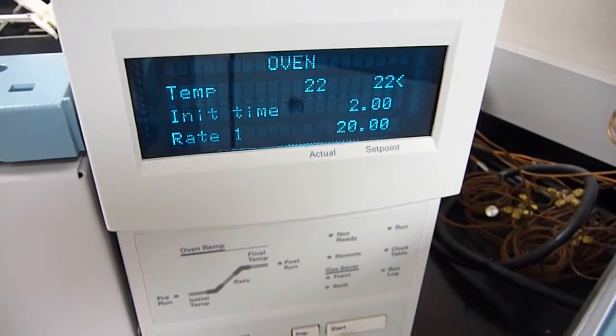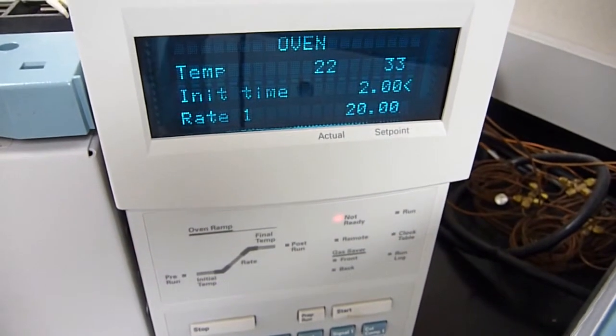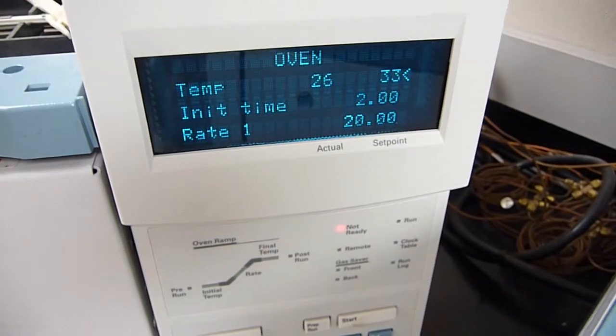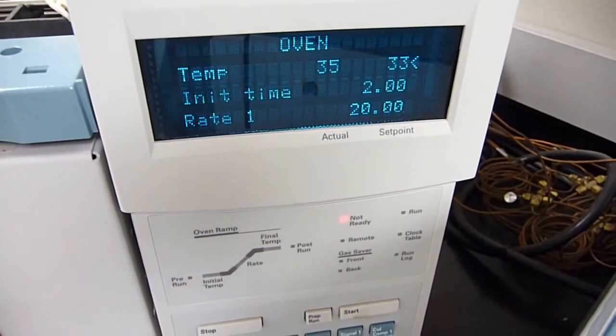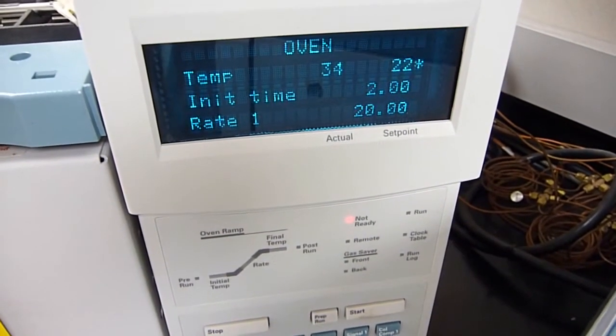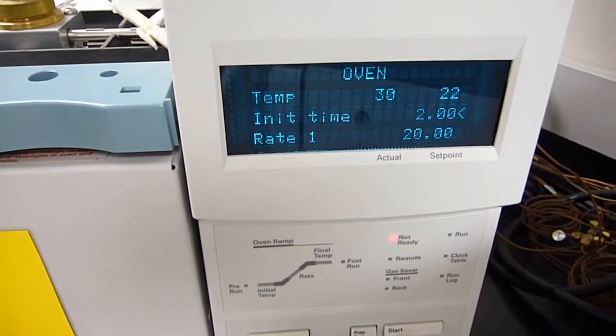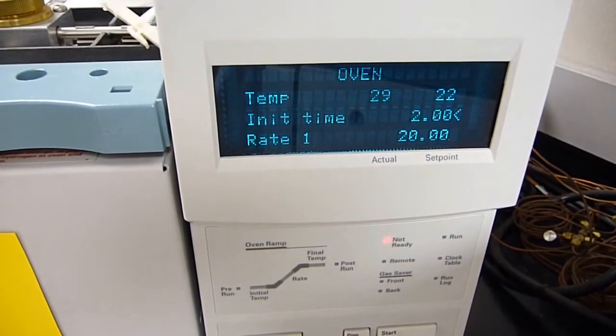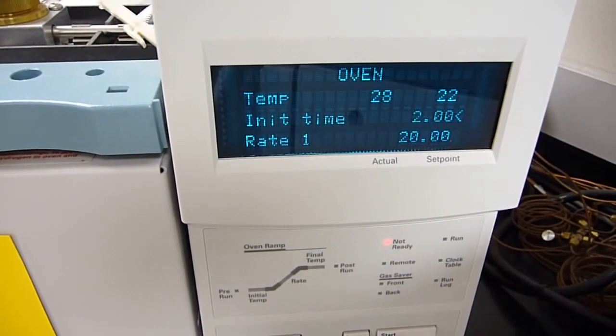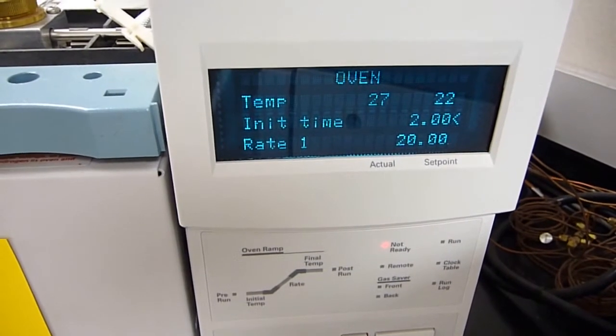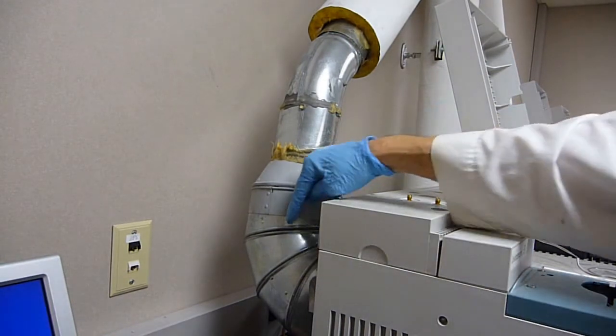And, let's test to see that it works. So, we'll enter 33. See if it heats up. Heats up. I don't have any helium flow through the column, so I don't want to get too hot. We'll enter 22. See if it cools down. And it's cooling down. So, the room's about 25 degrees, so I think it can't get much colder than that. And, here we have our deflector hooked up to the adapter, six to four, to the elbow, going into the four-inch ductwork.